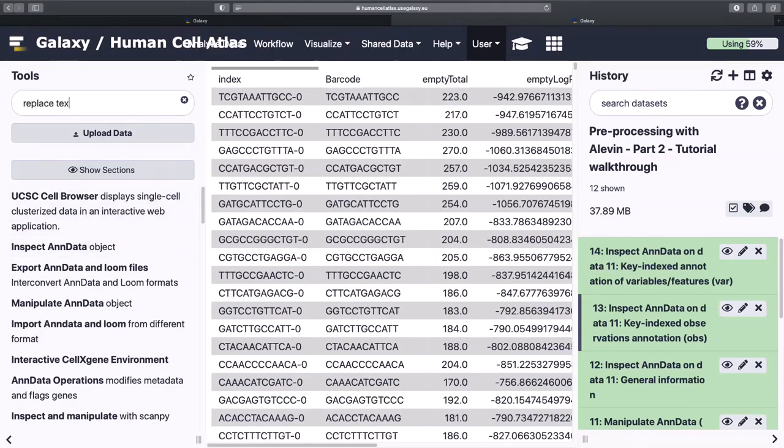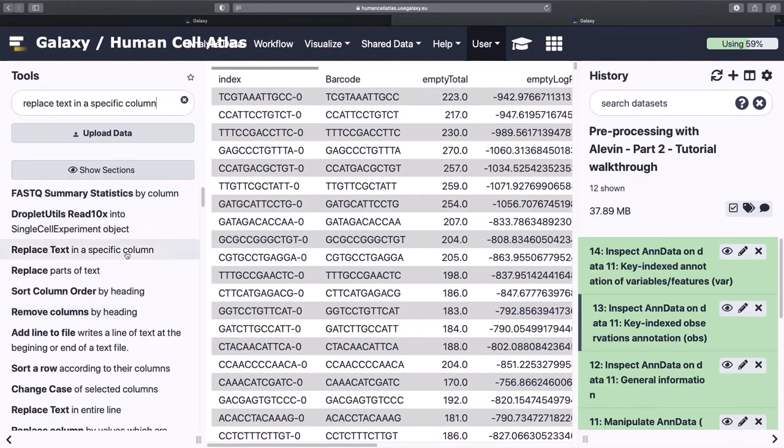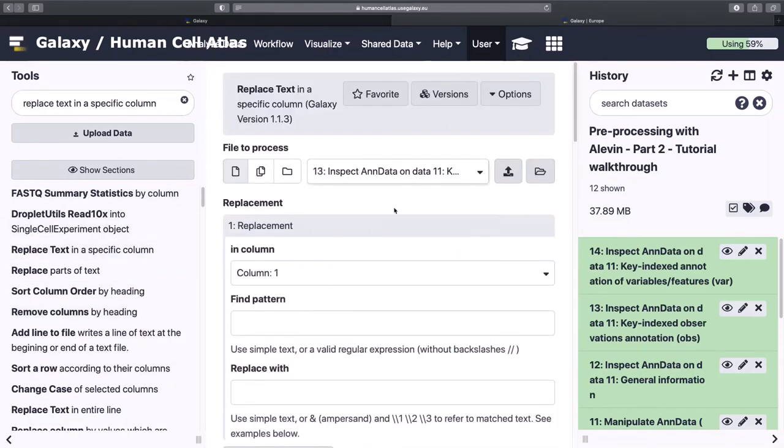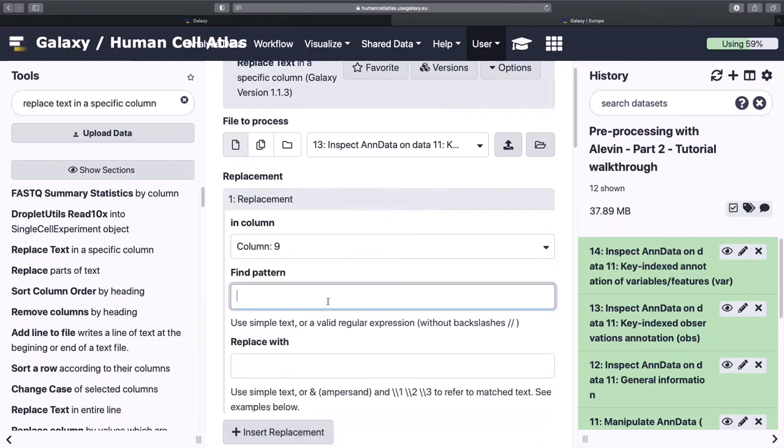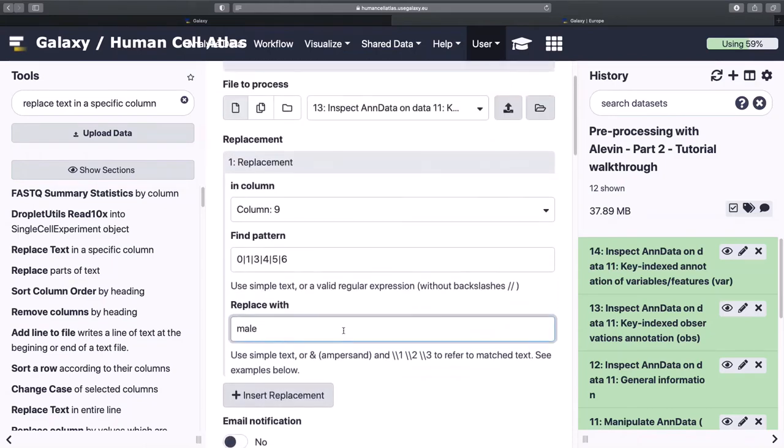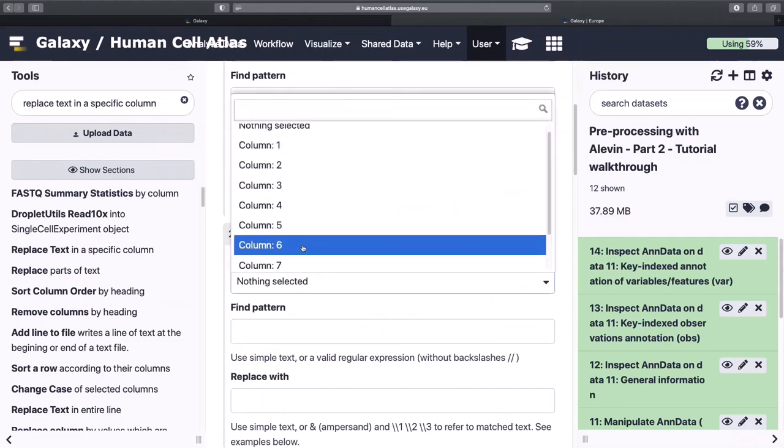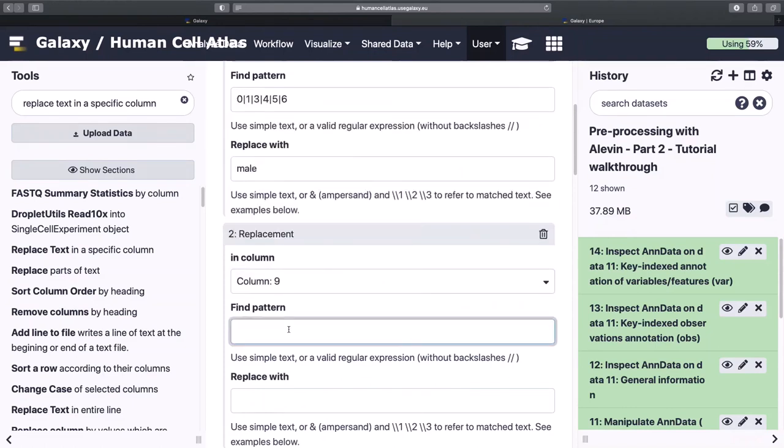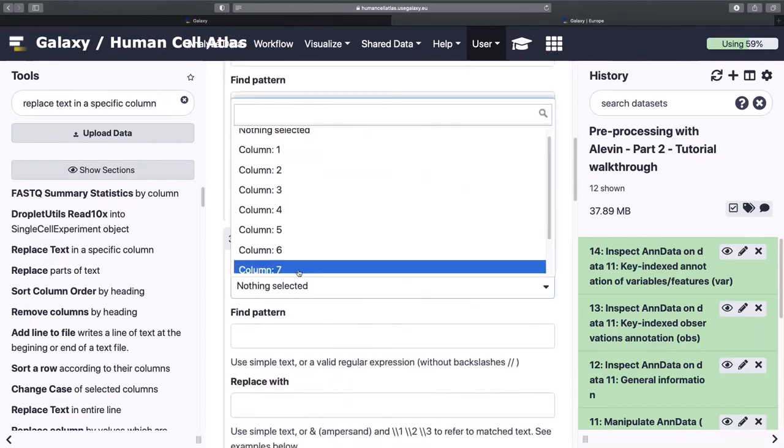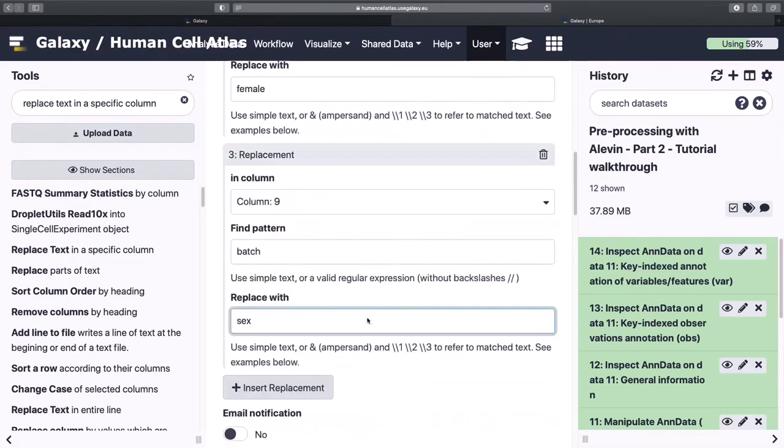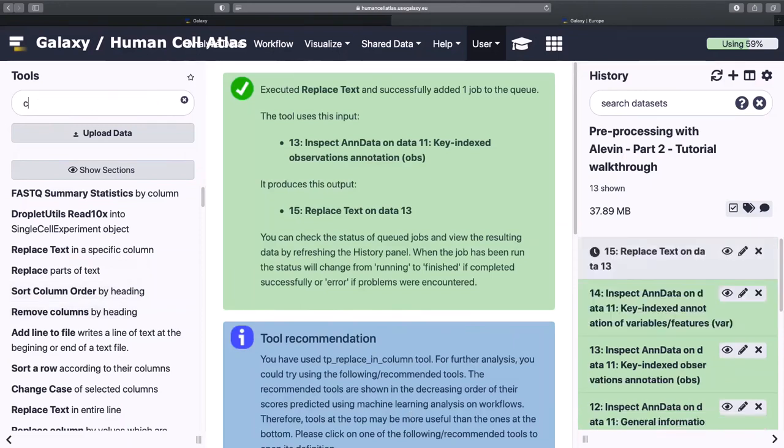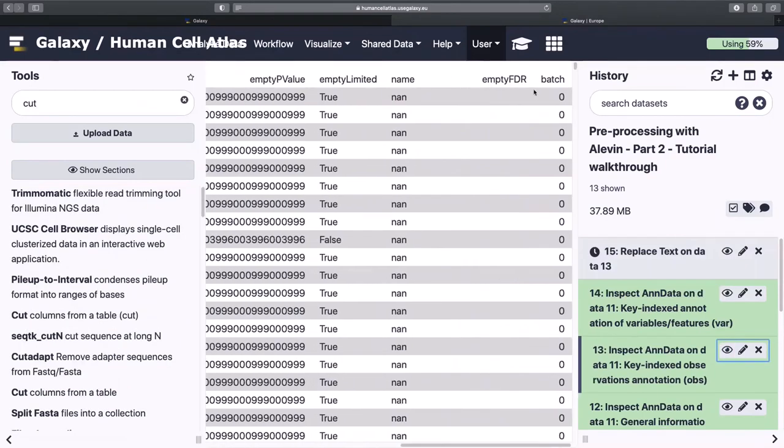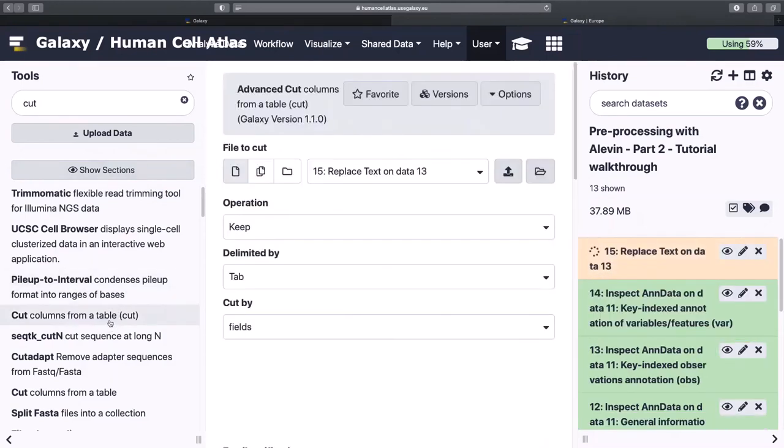All right, so we're going to go with replace text. And we want our observations, so this is our cell data. And remember that these numbers are, this is found from that experimental design object. This is how you can figure out which batch is supposed to be what. We only had one female, and we're going to rename that whole column sex.